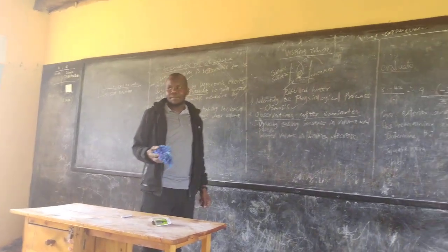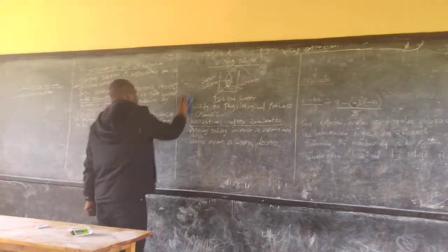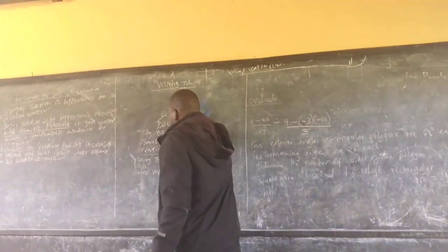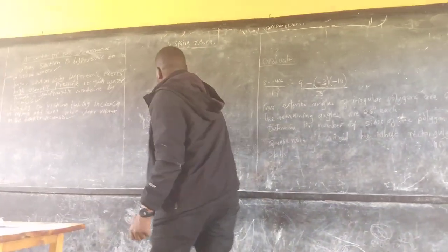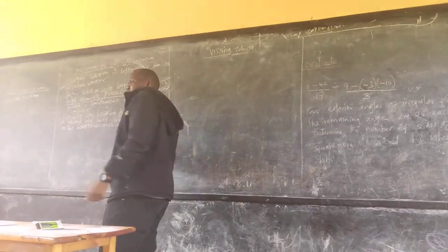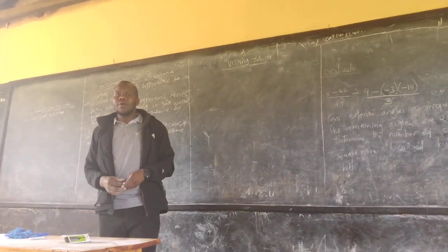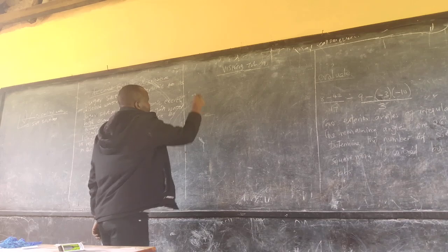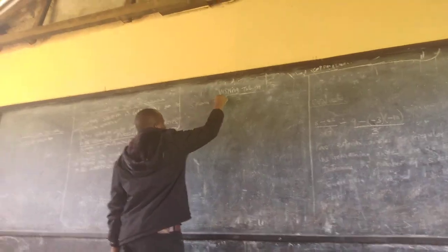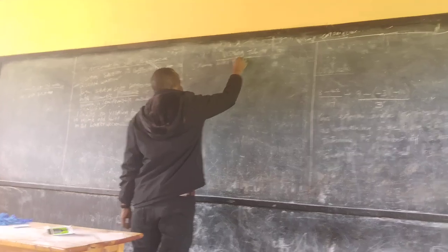Let's use a second experiment. We are using a plant material, a plant material in the lab. That was KCSE last year. What they were given last year was a petiole.